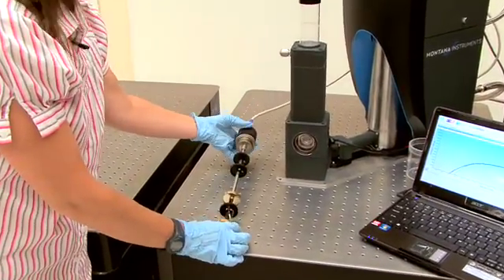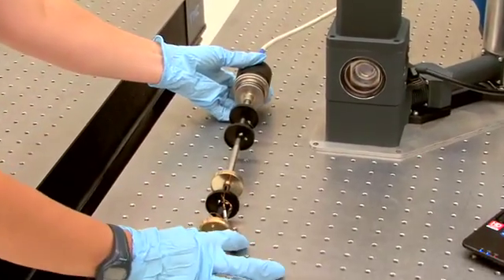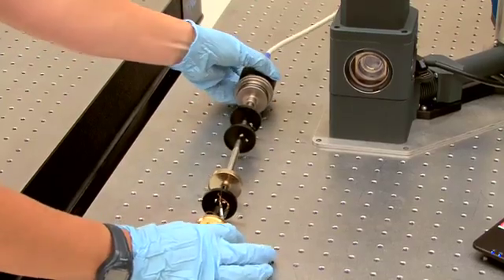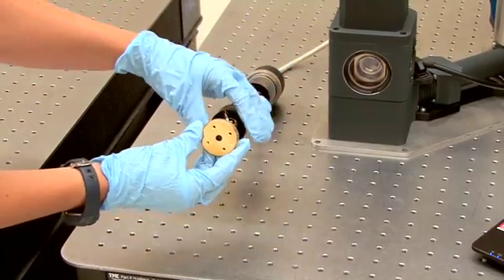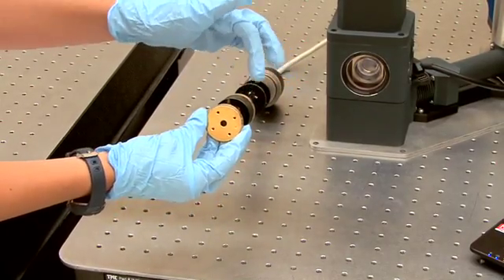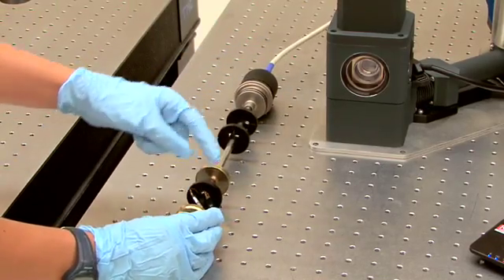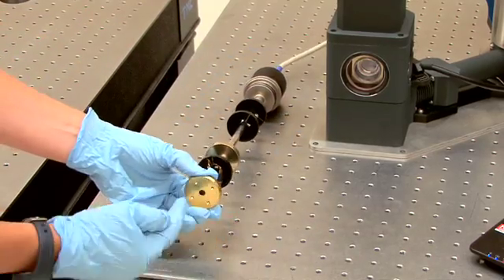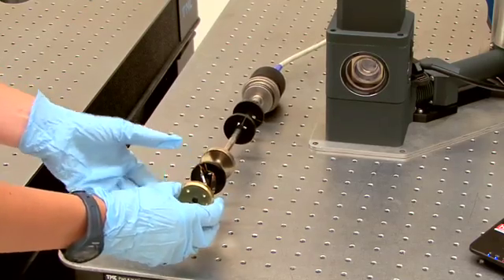This is the sample rod. There are several baffles along the length which are used to reduce convection as the unit cools. At the bottom there's a copper plate where you can mount your sample. You can either mount your sample with VGE or with bolts. There's a thermometer and sample heater that run to the end of the sample rod to provide accurate measurement of your sample.